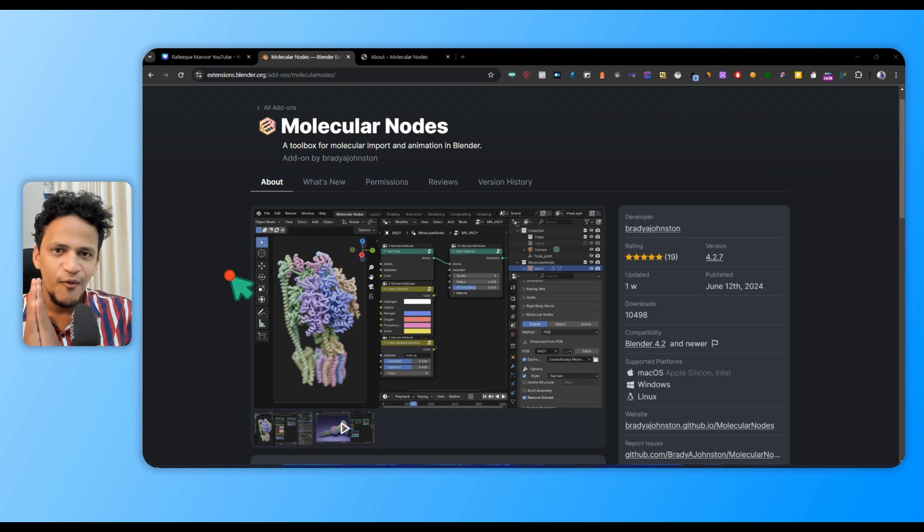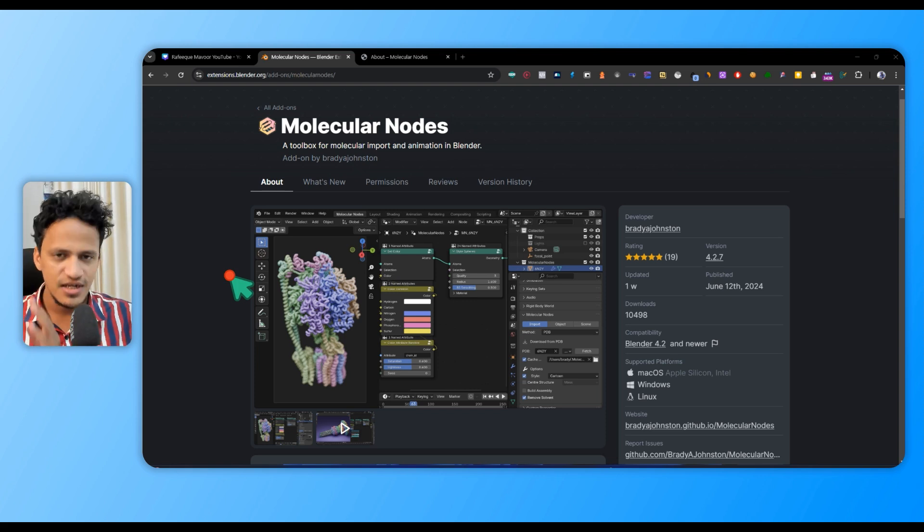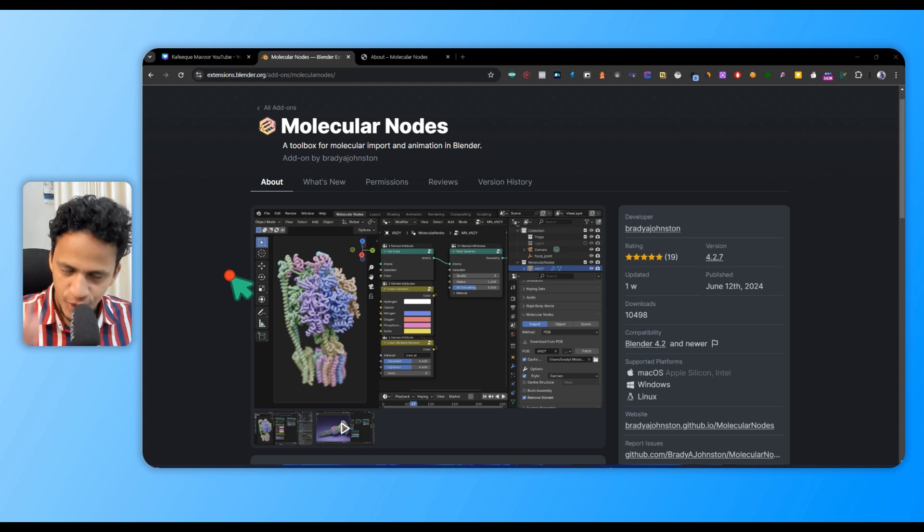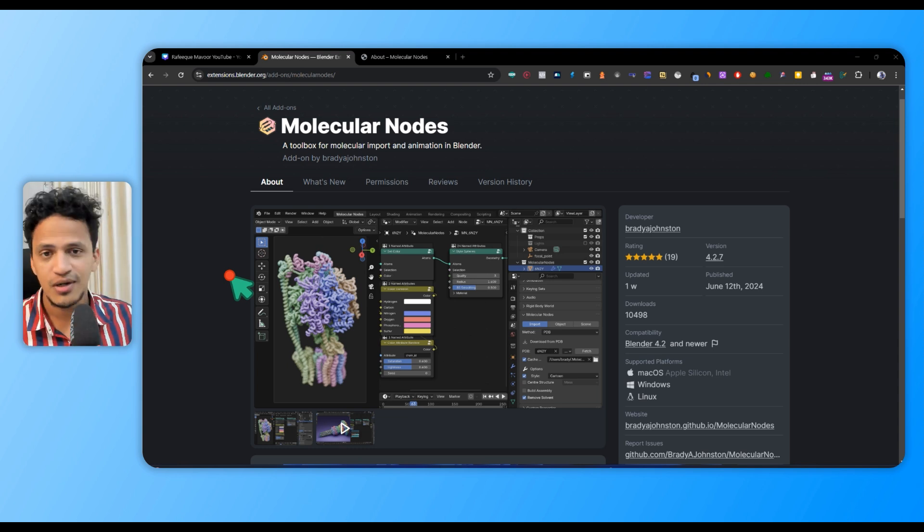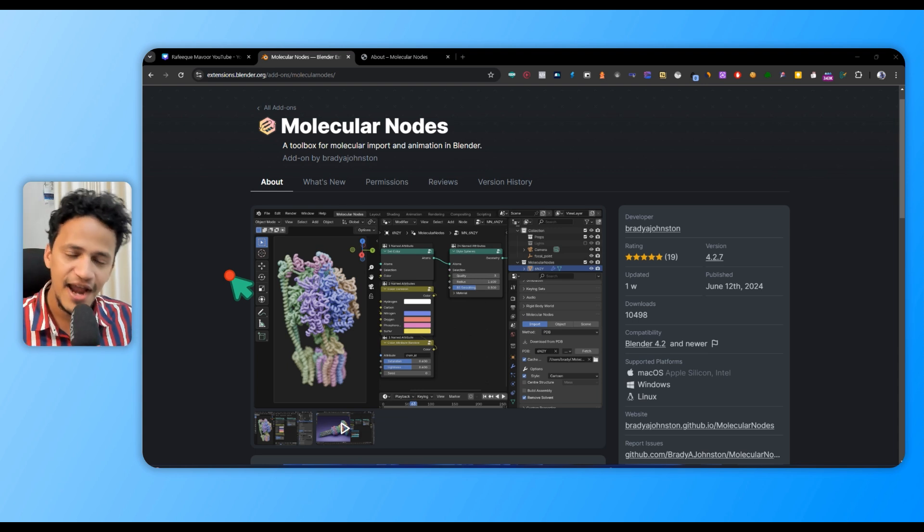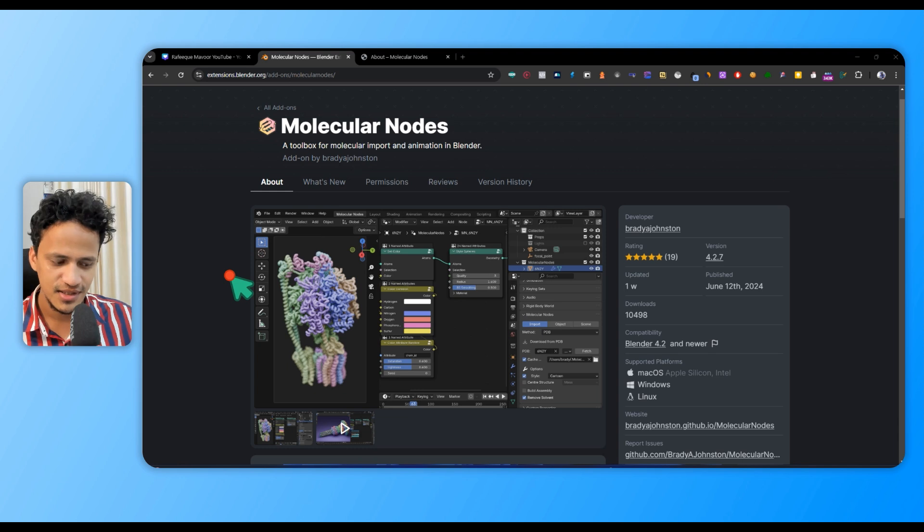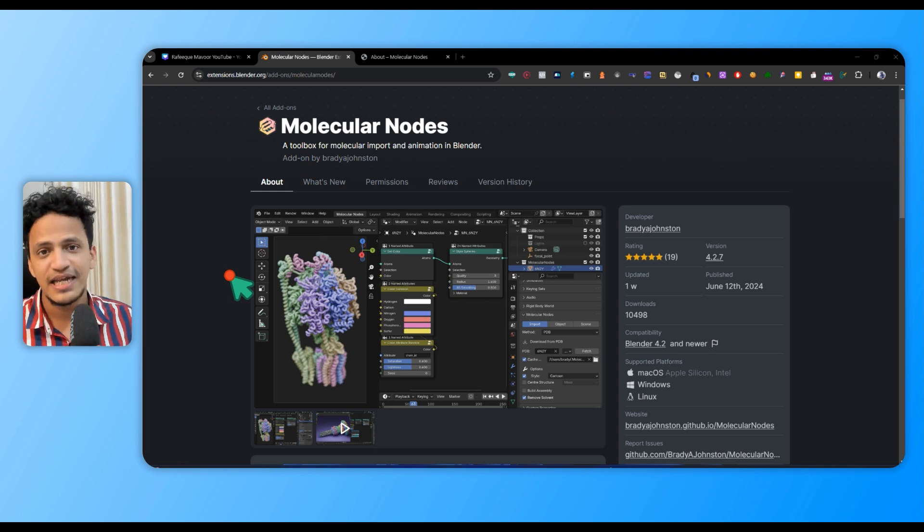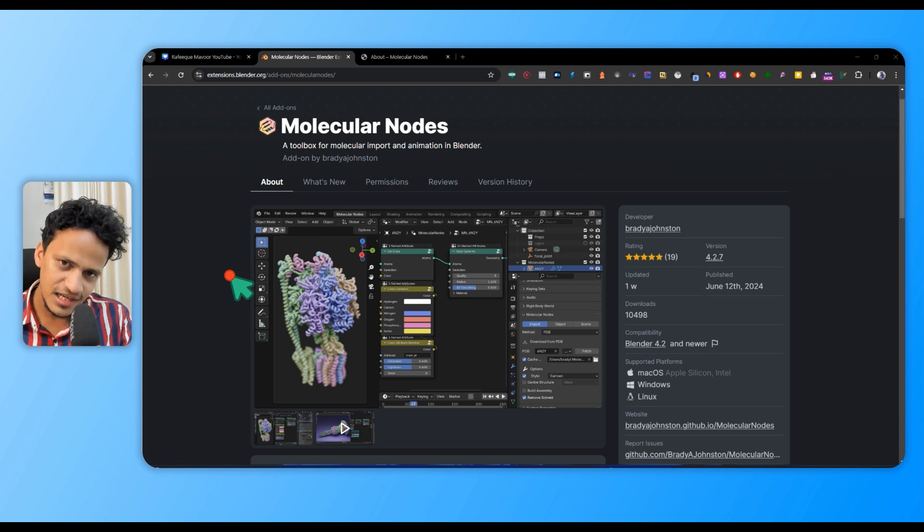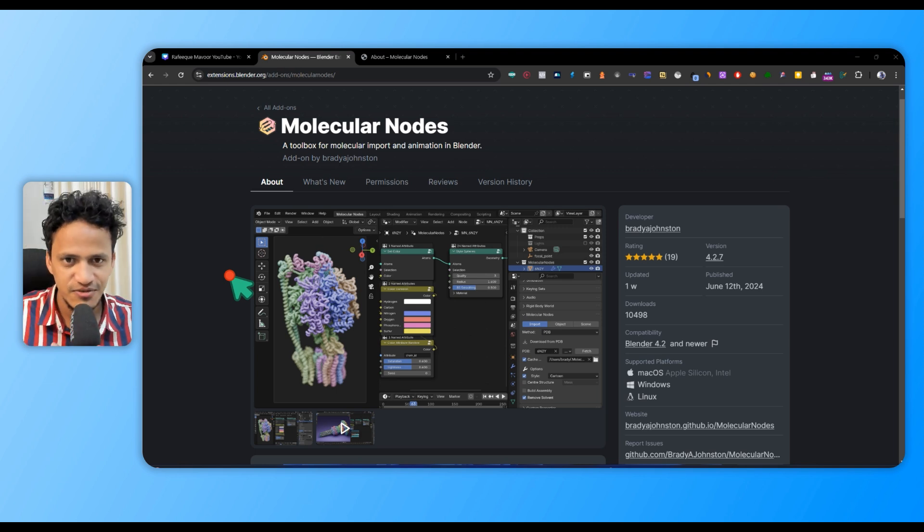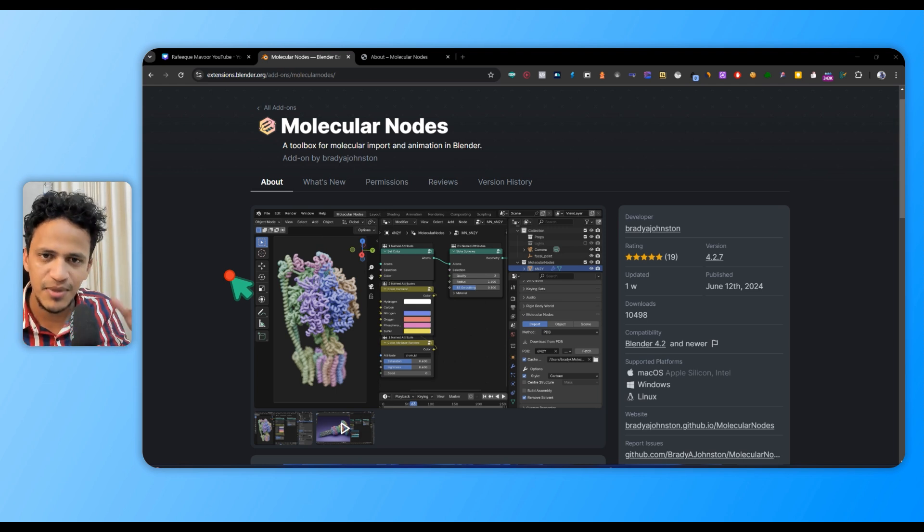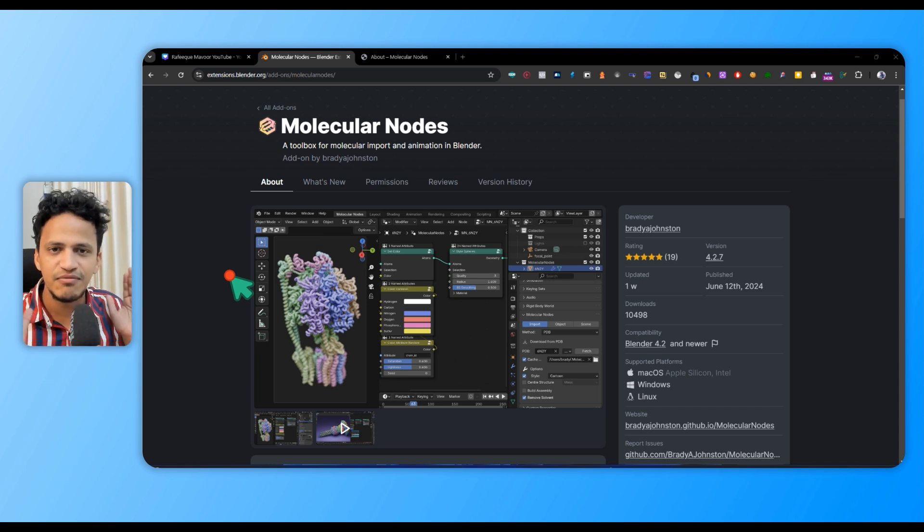Alright, what is Molecular Nodes? It's an add-on to visualize structural biology data like proteins, DNA, RNA, and molecular dynamics simulations. Developed by Brady Johnston, we can install it inside Blender, which allows us to directly import protein structures from Protein Data Bank.